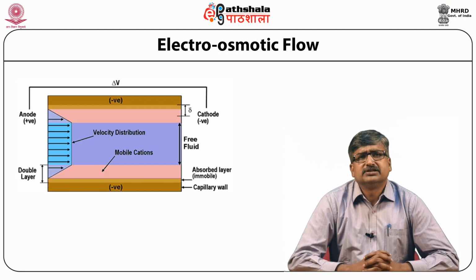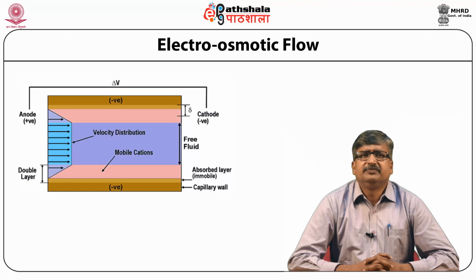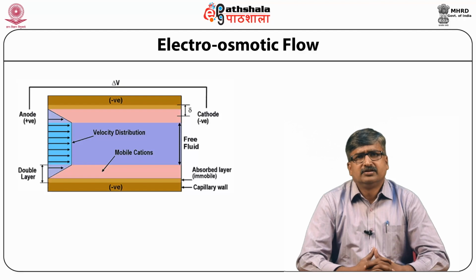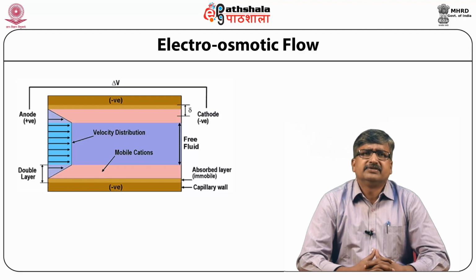The sample solution is injected from one end of the capillary, called the inlet end, and online detection is generally placed near the outlet end. Absorbance in the UV-visible region is the most common form of online detection. Other detection techniques are fluorescence, amperometry, conductivity, potentiometry, mass spectrometry, etc.